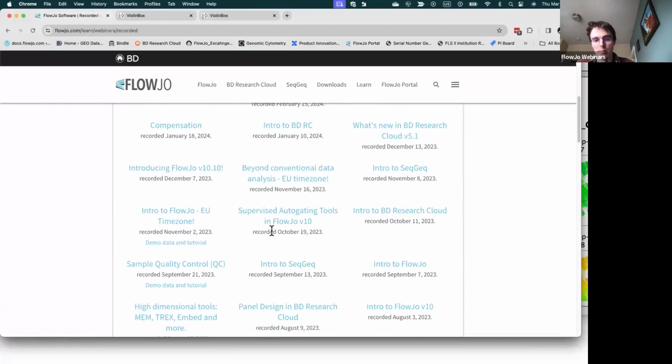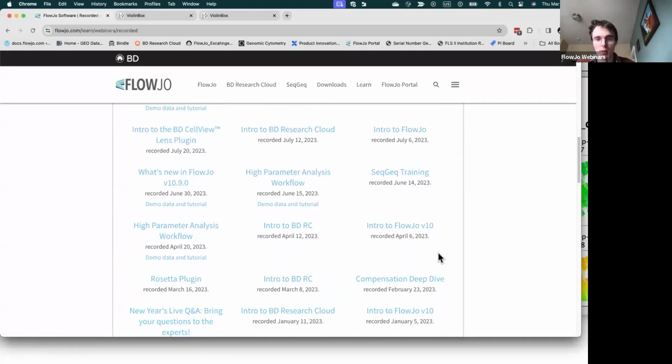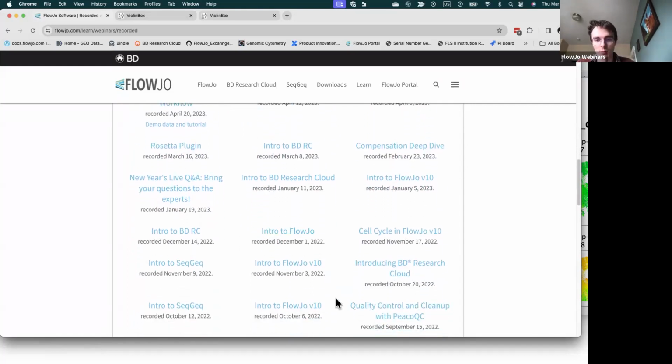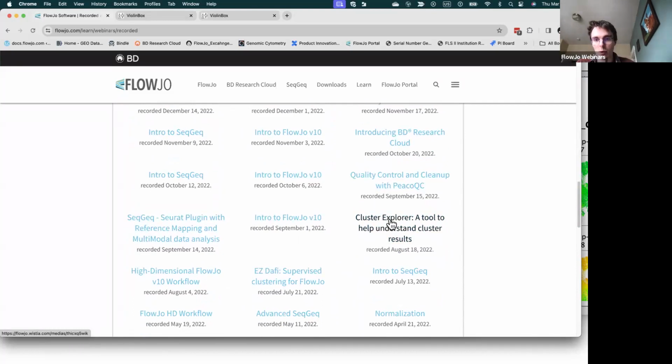Even the older recordings are going to be basically up to date, high parameter analysis workflow. The fundamentals like FlowSOM, UMAP, all that sort of stuff hasn't changed a whole lot in the last couple of years. So these older webinars are still pretty good. Cluster Explorer, we have a whole webinar on Cluster Explorer, which I kind of went through somewhat quickly today.